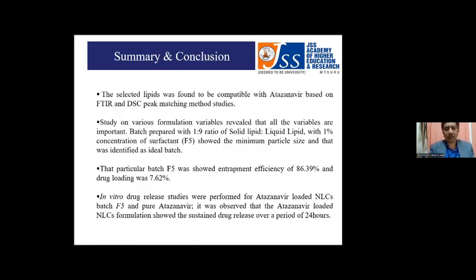Coming to the summary and conclusion, the selected lipids were found to be compatible with the drug atazanavir based on the results obtained through FTIR and DSC methods. The study on various formulation variables revealed that all the variables are important. However, the batch prepared using 1:9 solid lipid to liquid lipid with 1% concentration of Tween, the surfactant, showed the minimum particle size with maximum entrapment efficiency and drug loading. This batch F5 showed an entrapment efficiency of 86.39% with drug loading of 7.62%.